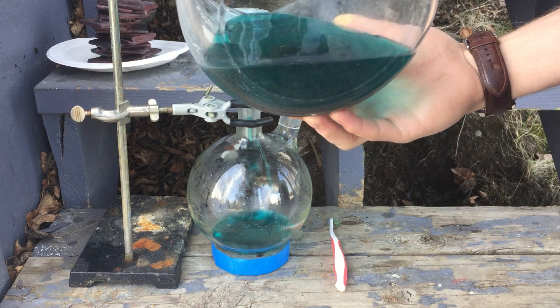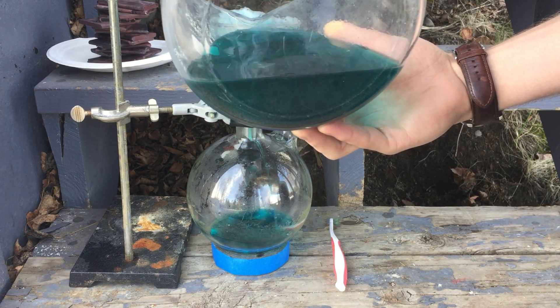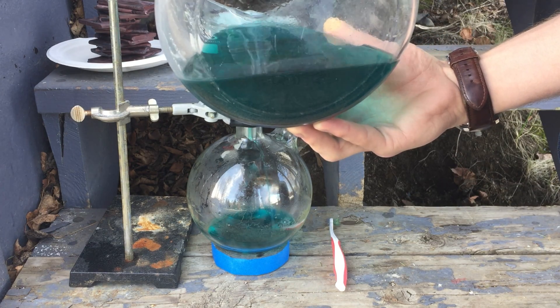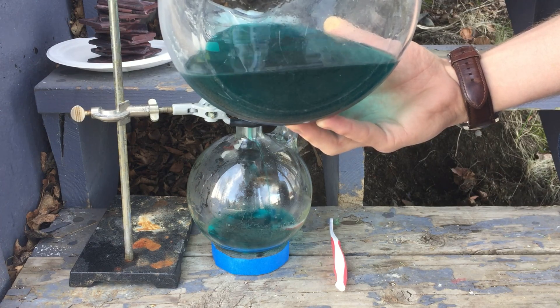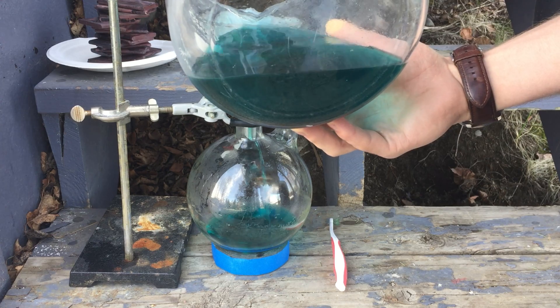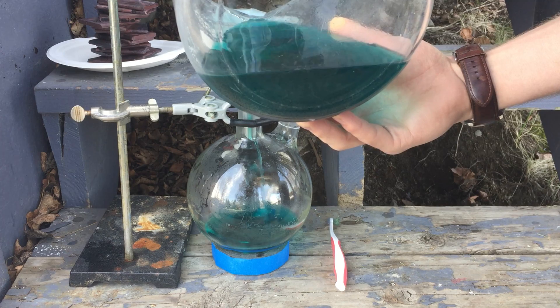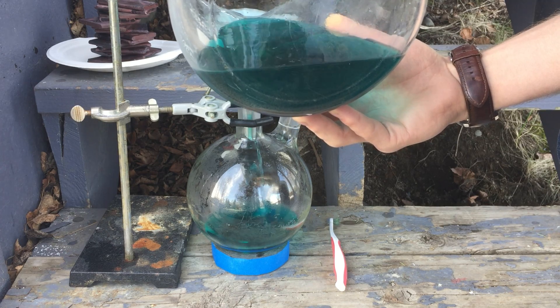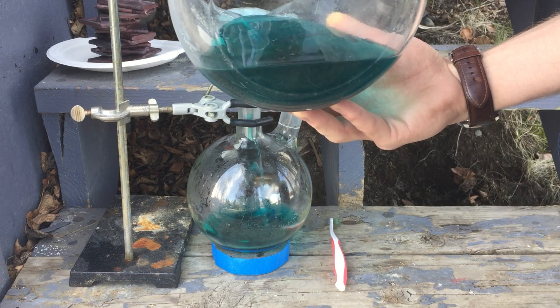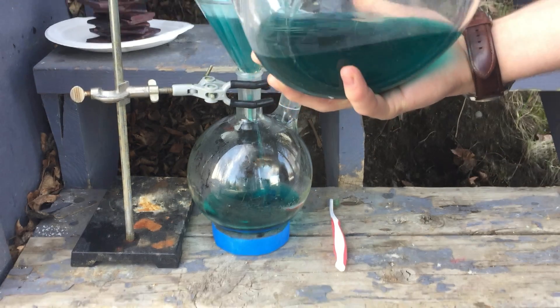After the filtration, the rest of the solution cannot be poured away though, and it must be properly treated to remove the acid and copper ions which are toxic to aquatic life. It's important to be responsible when doing chemistry and not destroy the environment. My waste treatment procedure entailed adding sodium hydroxide to the solution, which makes table salt, sodium nitrate, and insoluble copper hydroxide. I then collected the copper hydroxide to use for future projects.